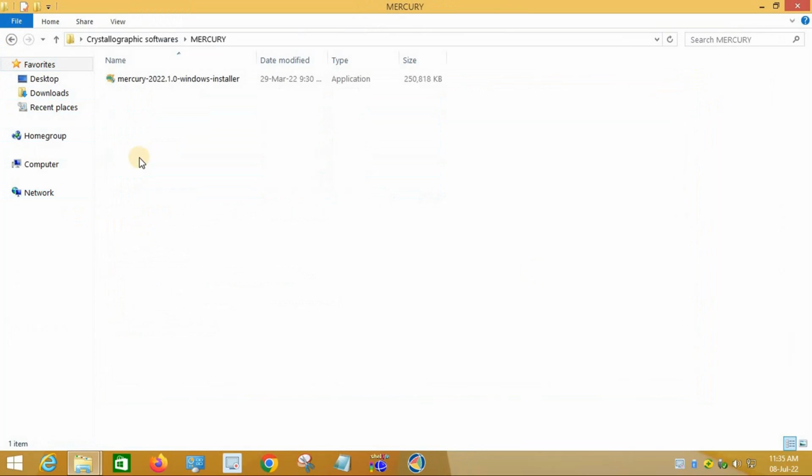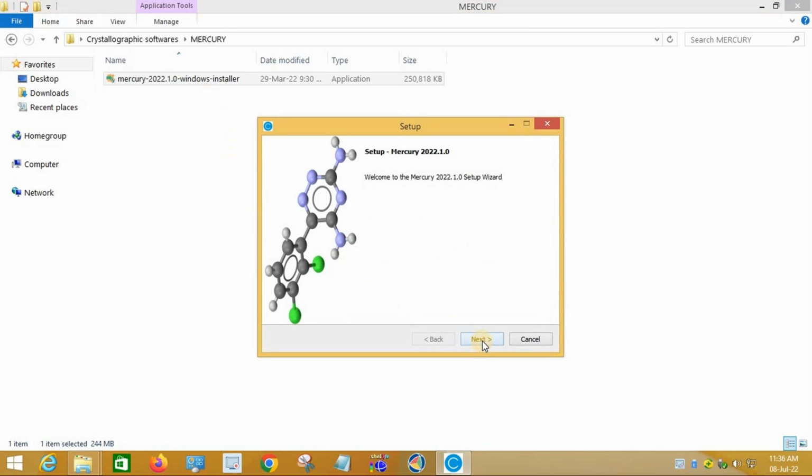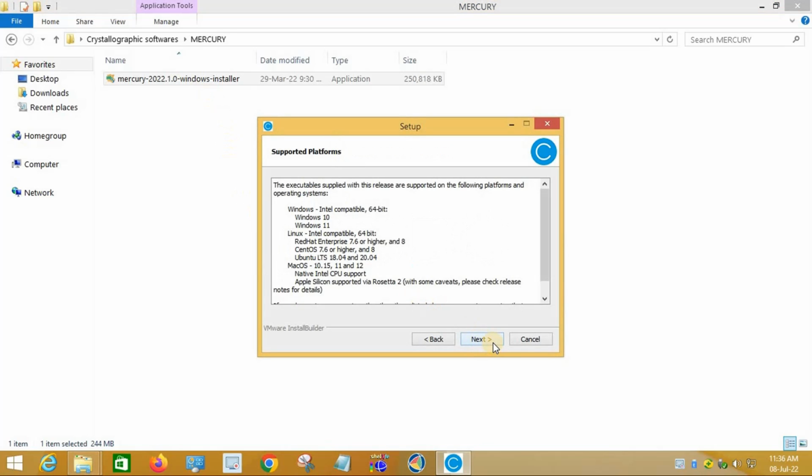Yes, we are left with Mercury. Go to Mercury, double click and it will start the installation. Say yes. Yes, it will take some time. Meanwhile, I am going to pause the video and I will start the video as soon as the program is installed.